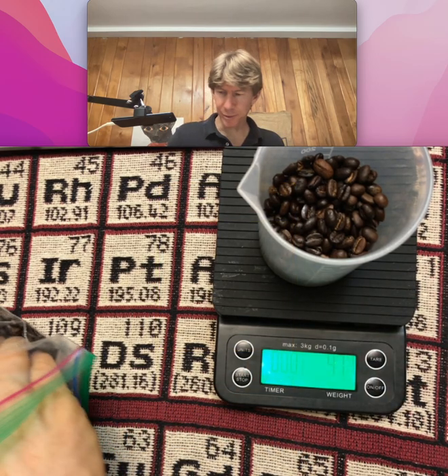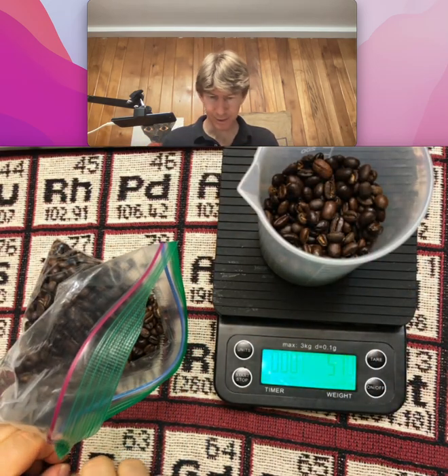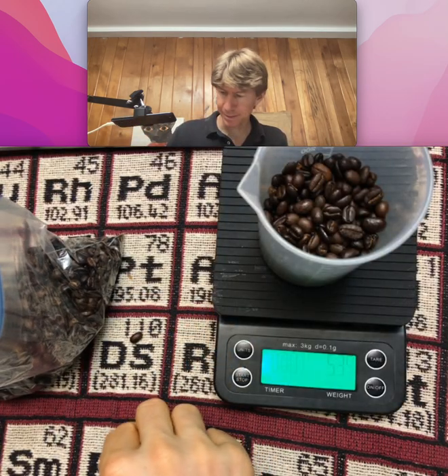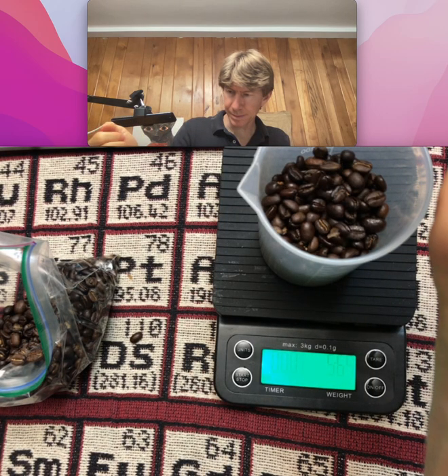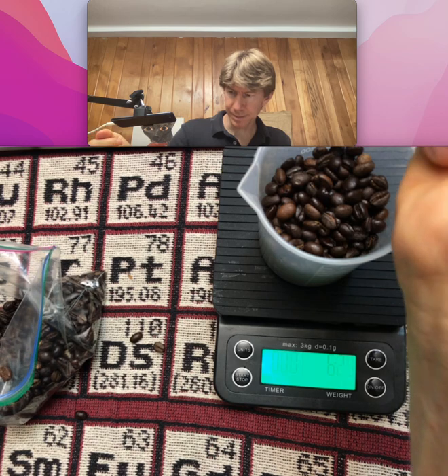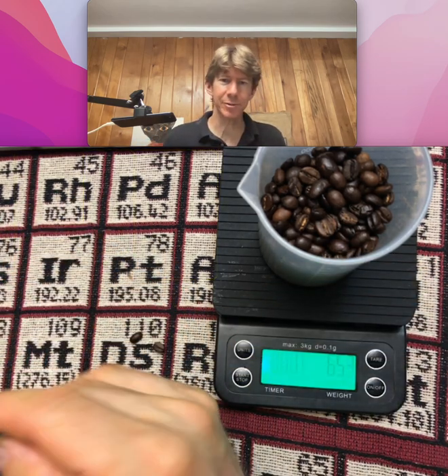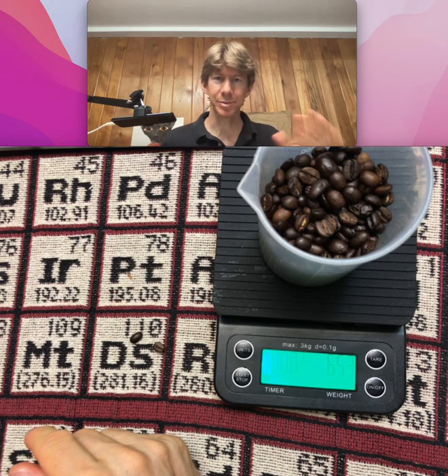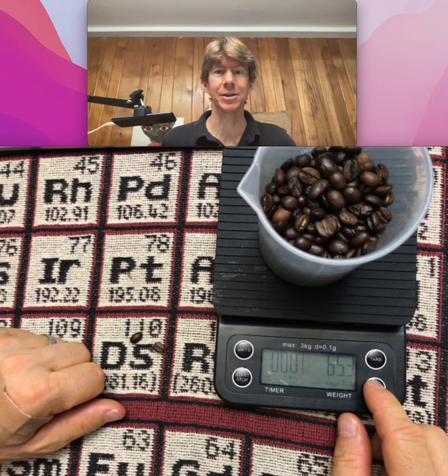I've got 47 — beans everywhere. 51... 54... and there — 65. 65.3. That's a good amount, close enough I would say. If you're plus or minus one gram, I think we do want 65 grams just to make sure we have enough for the entire activity.